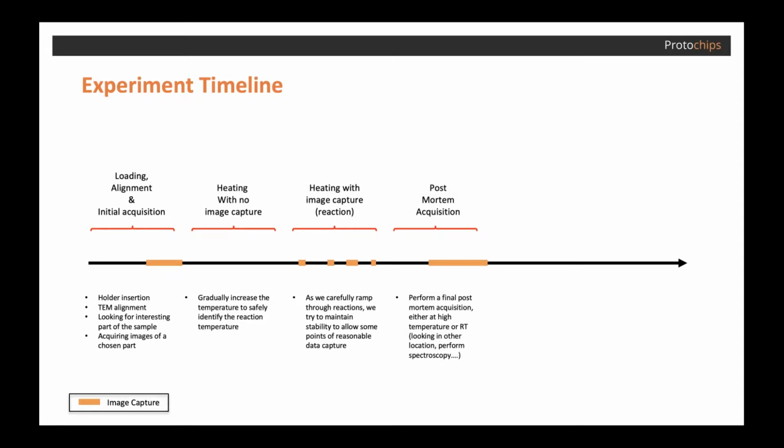Now, at the end of the temperature changes, we can hold the temperature at a constant level and capture the best images possible once things settle down. So now that data has been captured, we need to organize and label it with the parameters of the experiment, which is what we're dreading.